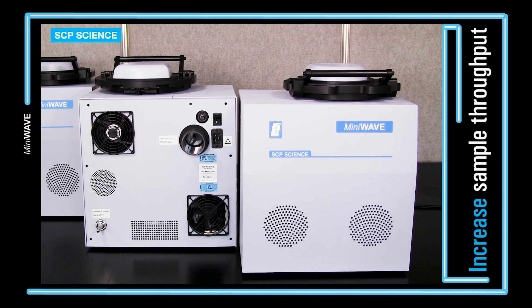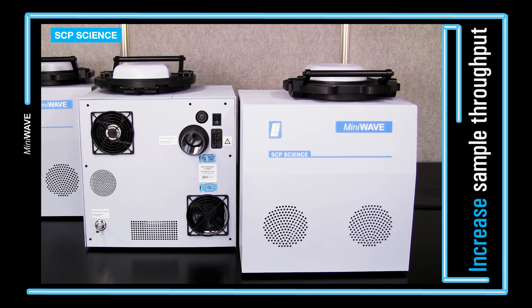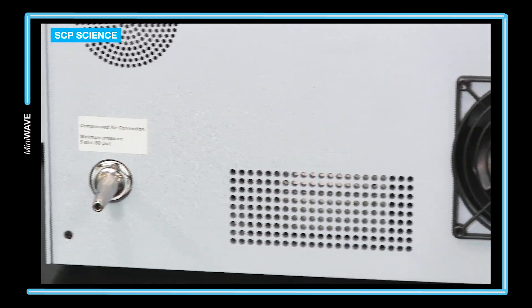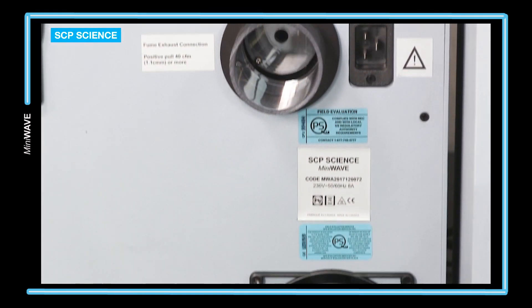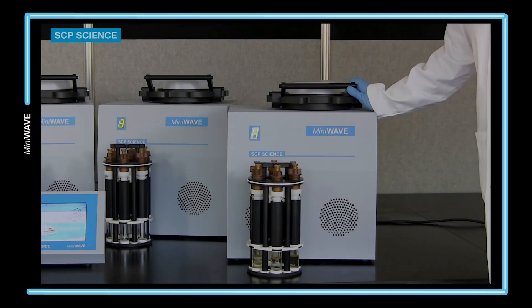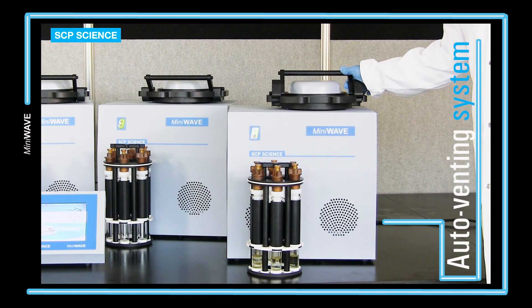Cooling samples is fast and easy via the compressed air connection. The cooling air is turned on automatically after the digestion is complete. The exhaust fan runs at two speeds: slow during the digestion and at full speed during the cooling step.